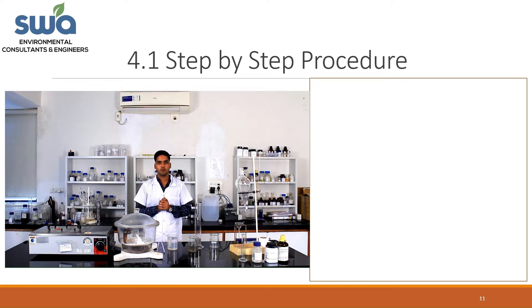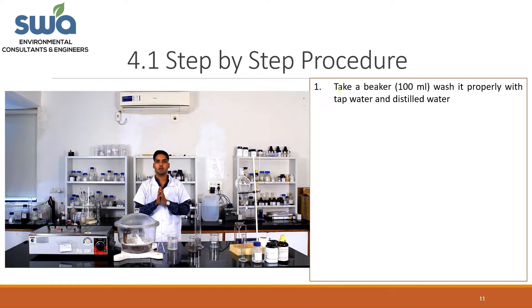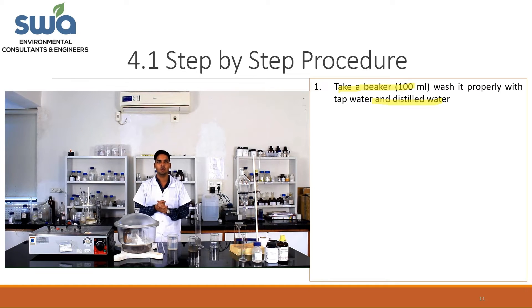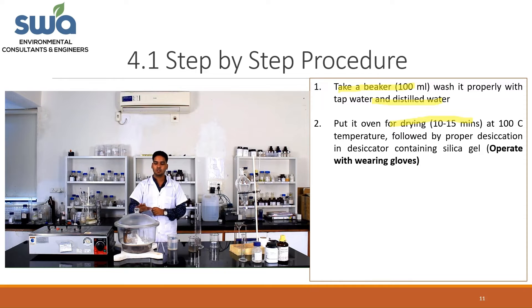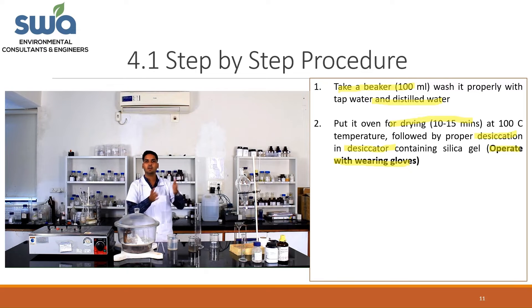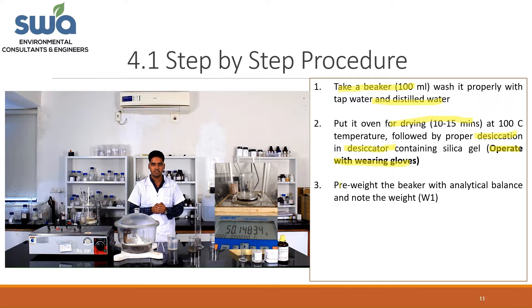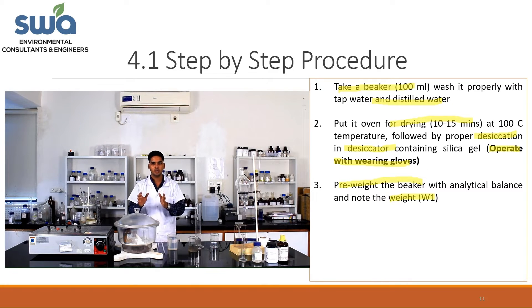Now we will start the step-by-step procedure. First, take a 100 ml beaker, wash it properly with tap water then distilled water, clean it with tissue paper, and dry it in an oven at 100°C for 10 to 15 minutes. After drying, transfer the beaker into a desiccator containing silica gel. Wear proper gloves throughout to prevent moisture from your hands transferring to the beaker and causing weight variation. After the silica gel has soaked the moisture, pre-weigh the beaker on an analytical balance and record the reading as W1.